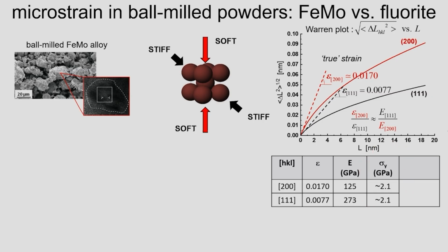Now, think of it. How can you measure the yield stress in a nanocrystal? It's not an easy task. Can you think of a nano machine pulling a nanocrystal? It's not easy. So it's nice that using diffraction, you can estimate something which is extremely hard to measure. And is this real or not? In the case of metals, there are studies carried out over the past 20 years with different techniques, and many times just wild hypotheses on what the yield stress in a nanocrystal should be.